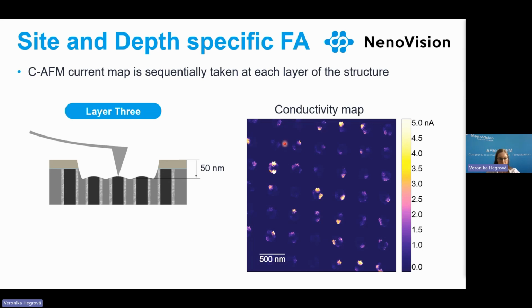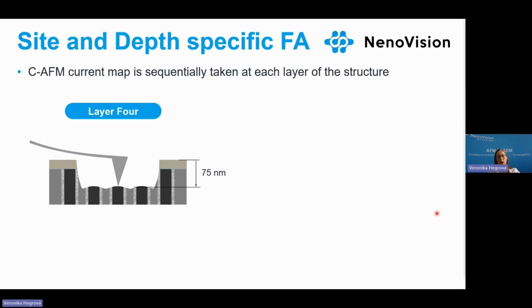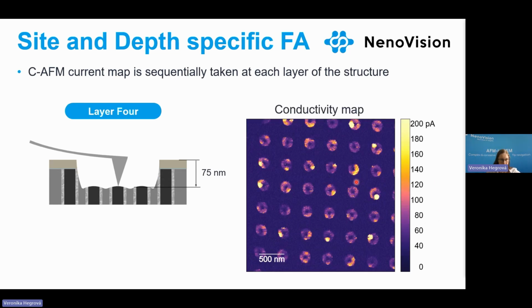So we already can see that some parts of polysilicon channel are well visible. And when we continue further, we can nicely see the whole channel. And as it's polysilicon, the conductivity varies at the channel.